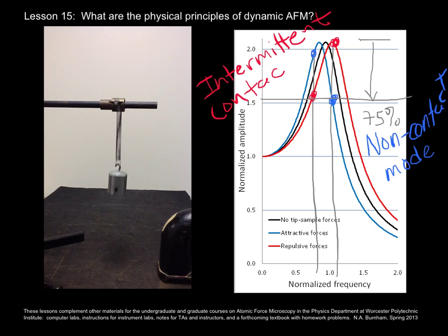So you might have heard these terms about AFM: non-contact mode and intermittent contact mode, abbreviated IC-AFM and NC-AFM.